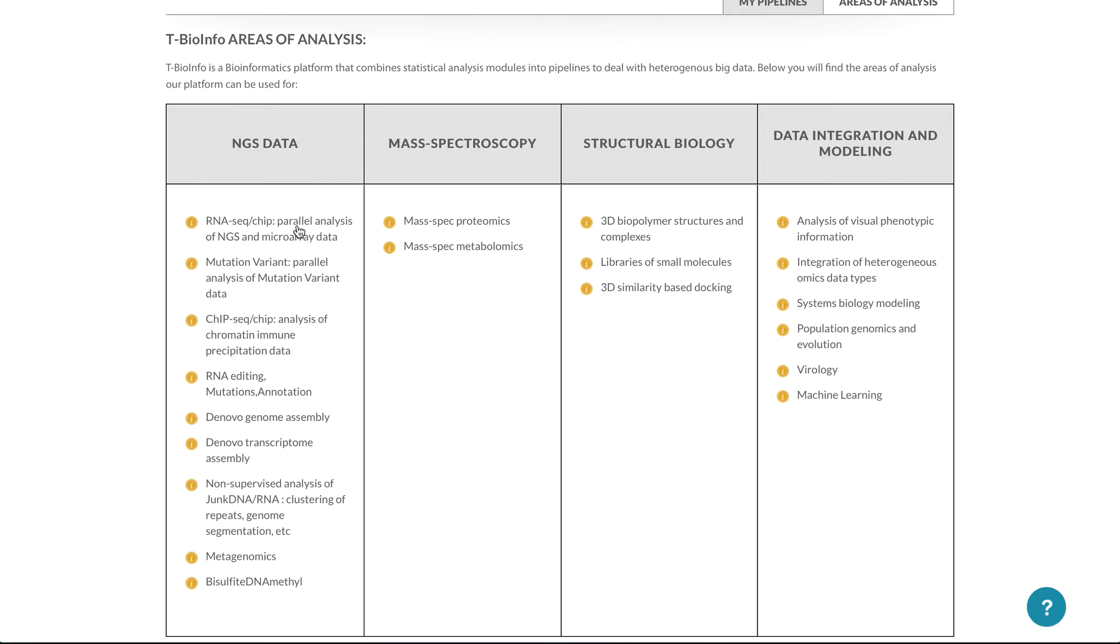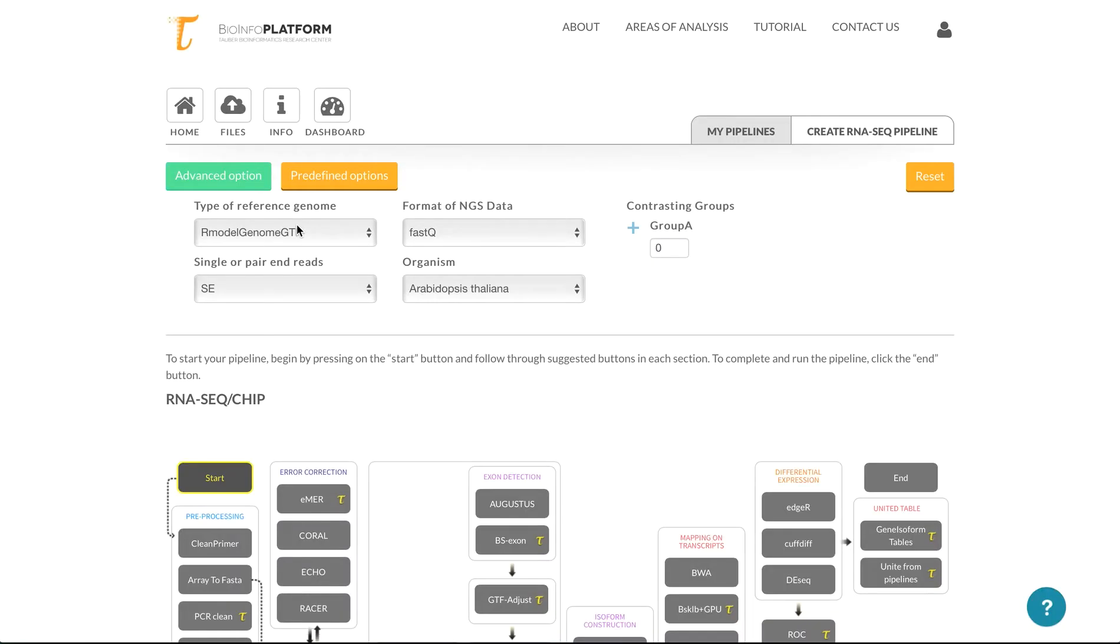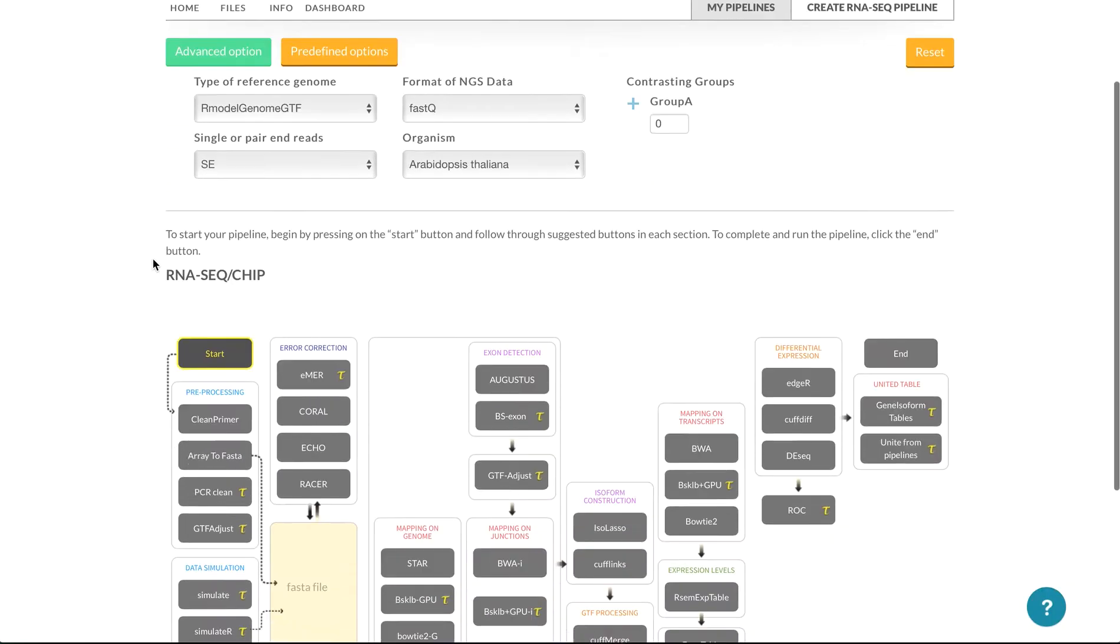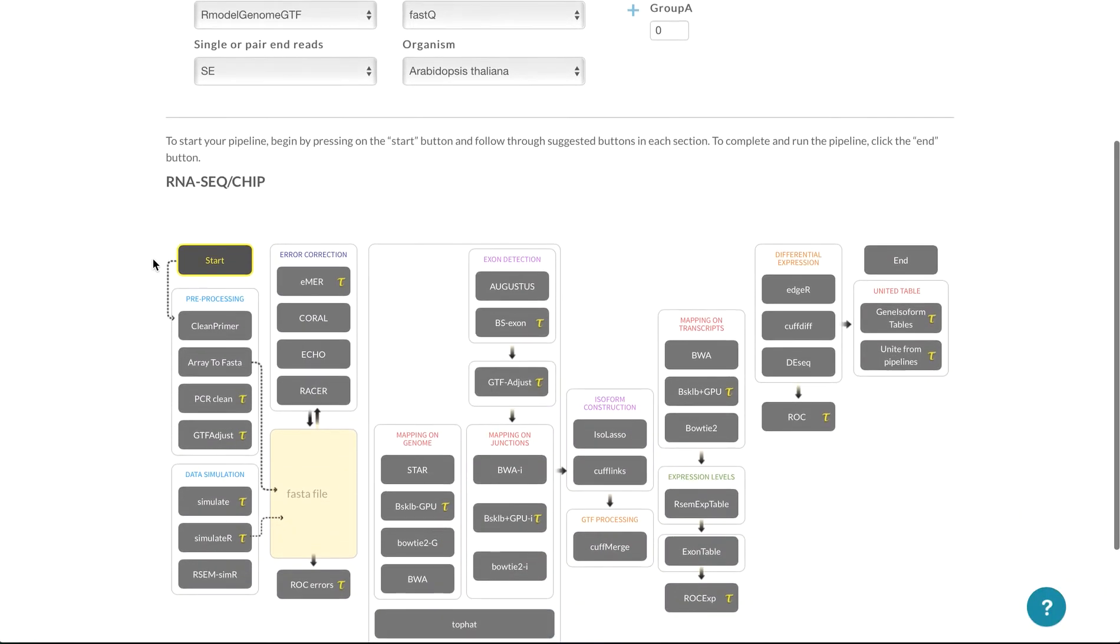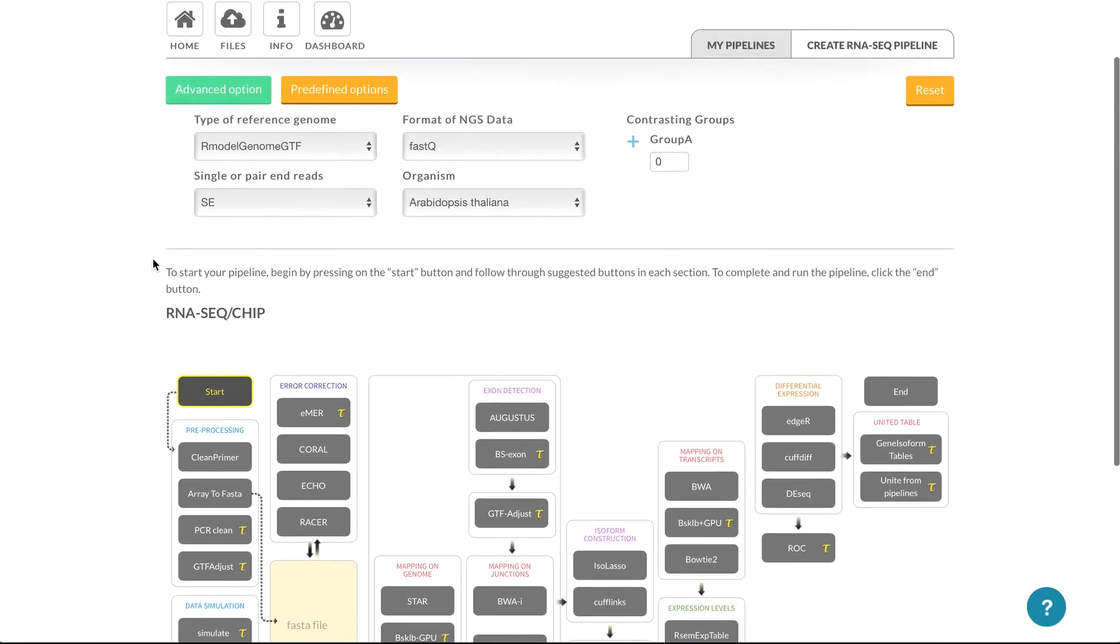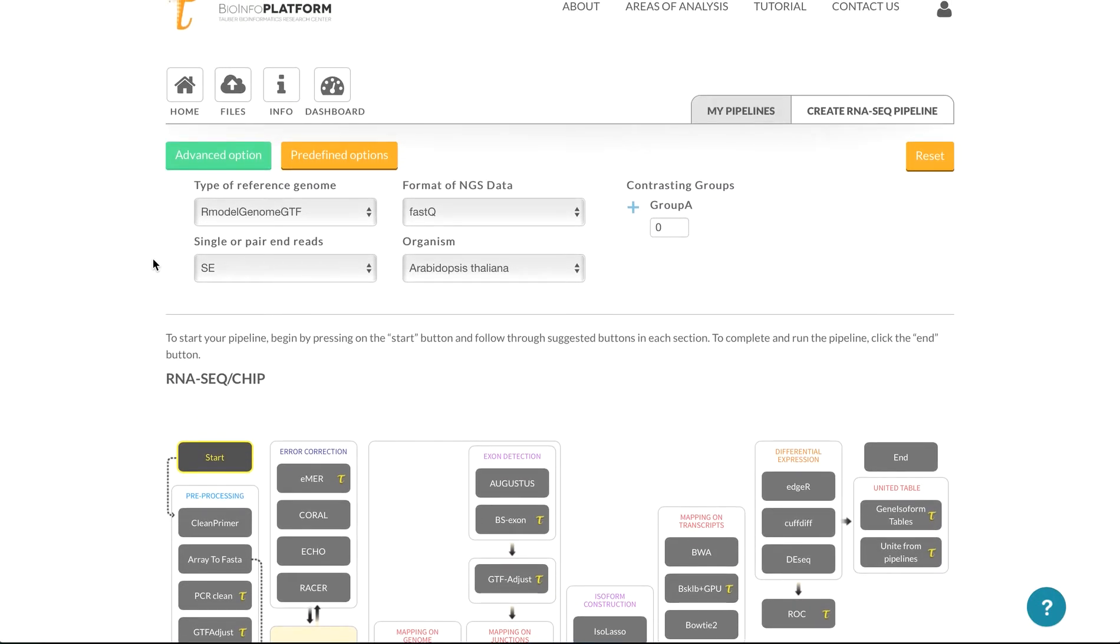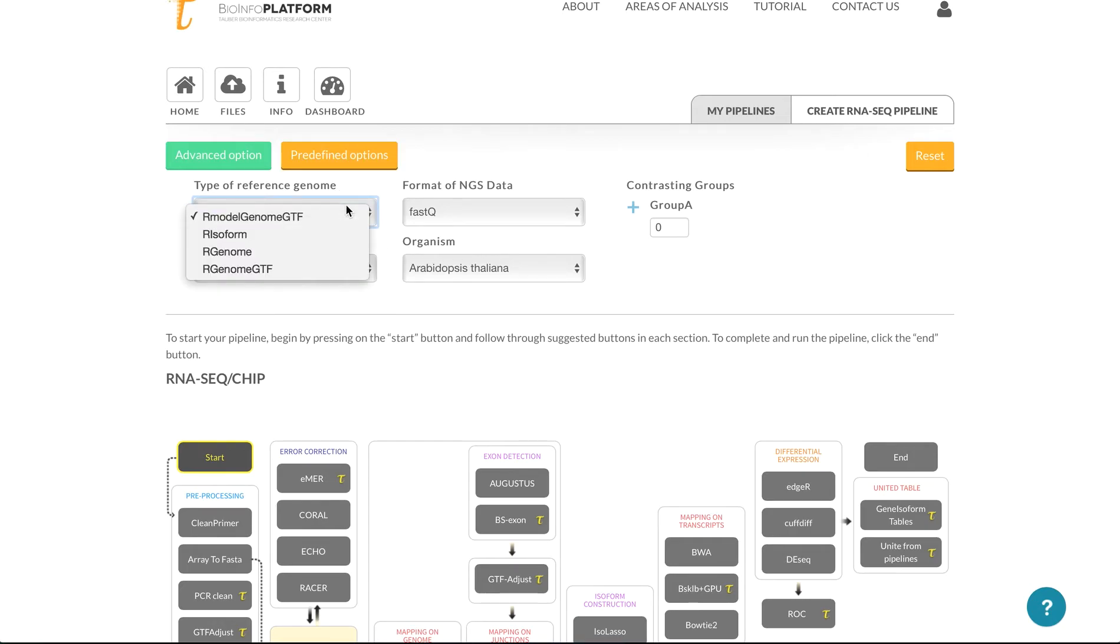So if we take a look at RNA-Seq, which is under NGS, we can see that the whole screen is going to be divided into two sections, the top section that is user input of data type, so we can take model genome, that's one of the genomes that's uploaded on the system.